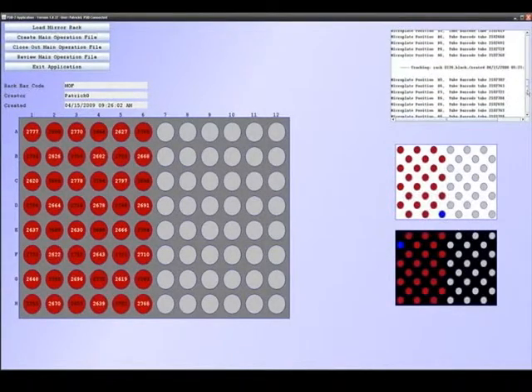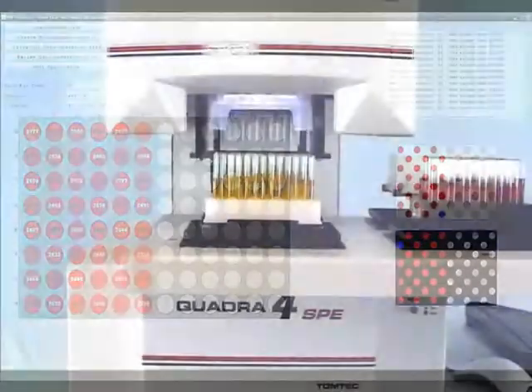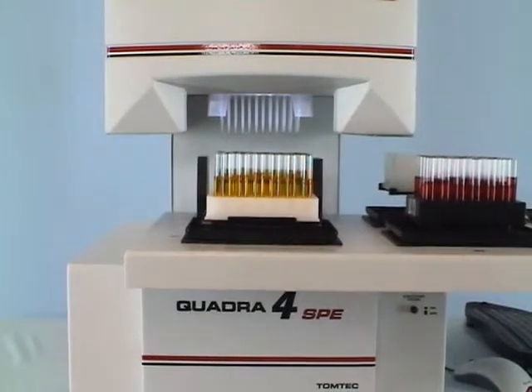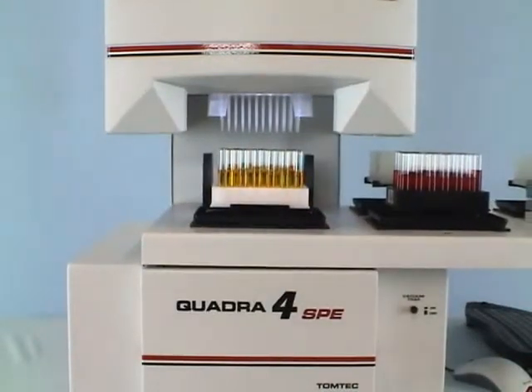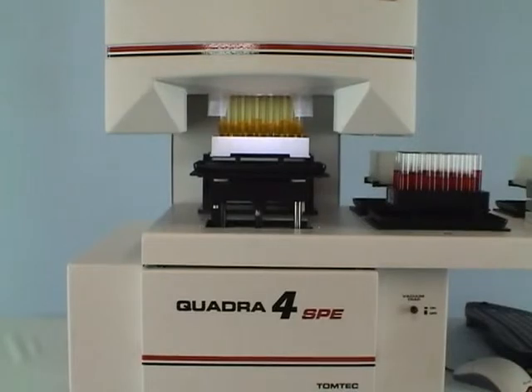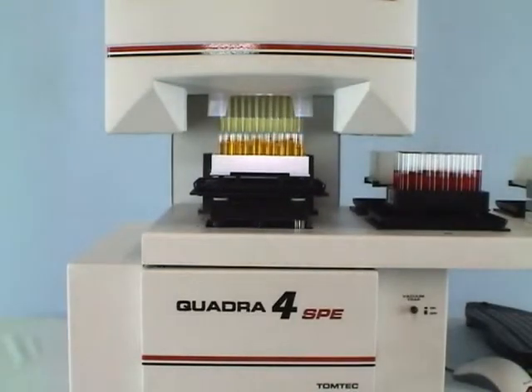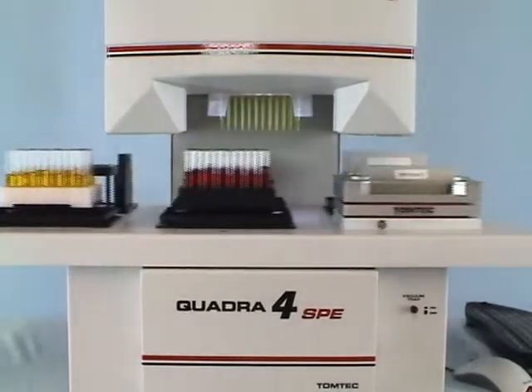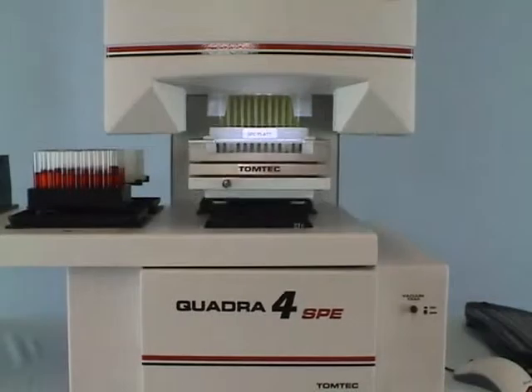For processing, the white and black mirror racks are placed on the Quadra shuttle along with the barcoded 96-well destination plate. As each plate moves to the pipetter head, the barcode is appended to the processing file to maintain a positive audit trail. The 96-well destination plate is then processed on the Quadra using one of several sample preparation techniques. A simple protein crash method may be used, a liquid-liquid extraction, or a solid phase extraction.